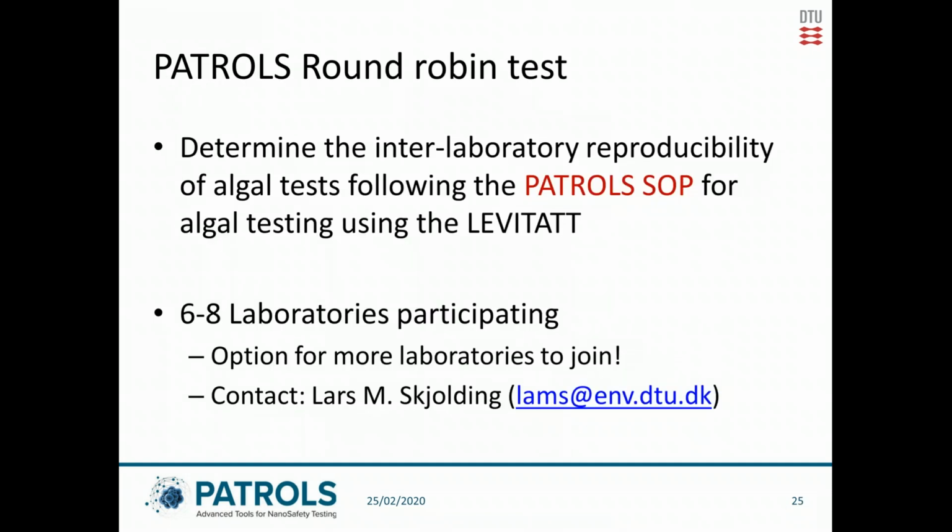In PATROLS, we have initiated a round-robin test. It will be used to determine the interlaboratory reproducibility of the algae test if we follow the protocols that have been developed in PATROLS and also using the LEVITATT. So the aim of the interlaboratory test is twofold. One is to actually test the setup as it is, as the LEVITATT, but also in combination with the PATROLS SOP. Right now we have approximately 8 laboratories participating, but there is of course option for more laboratories to join in. If you are interested, you can contact me in this email.